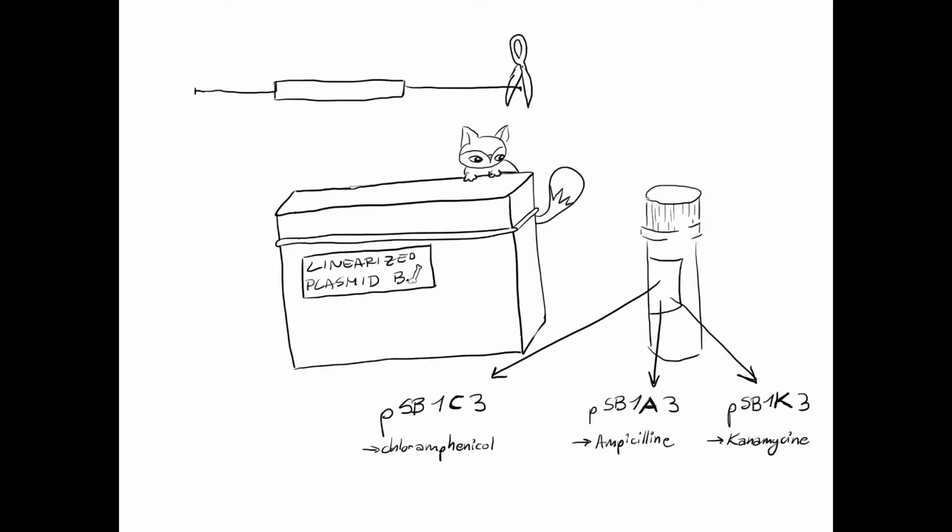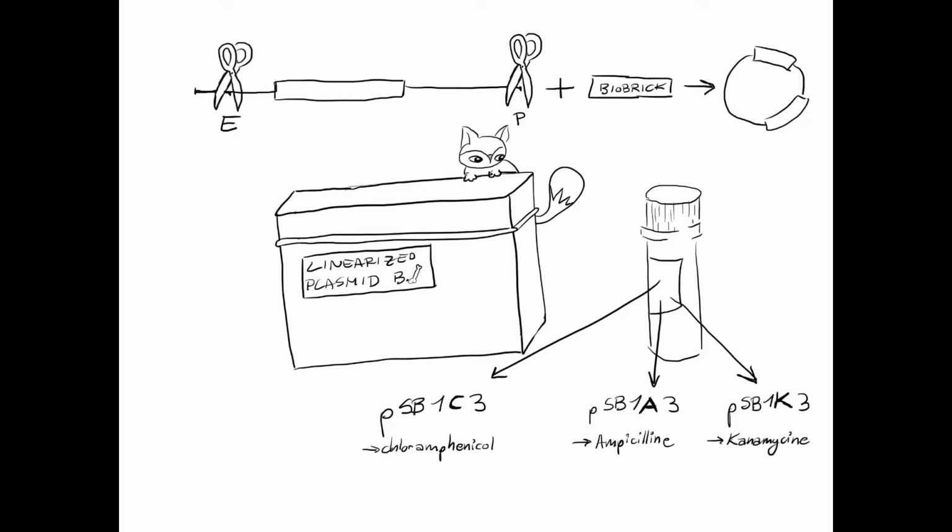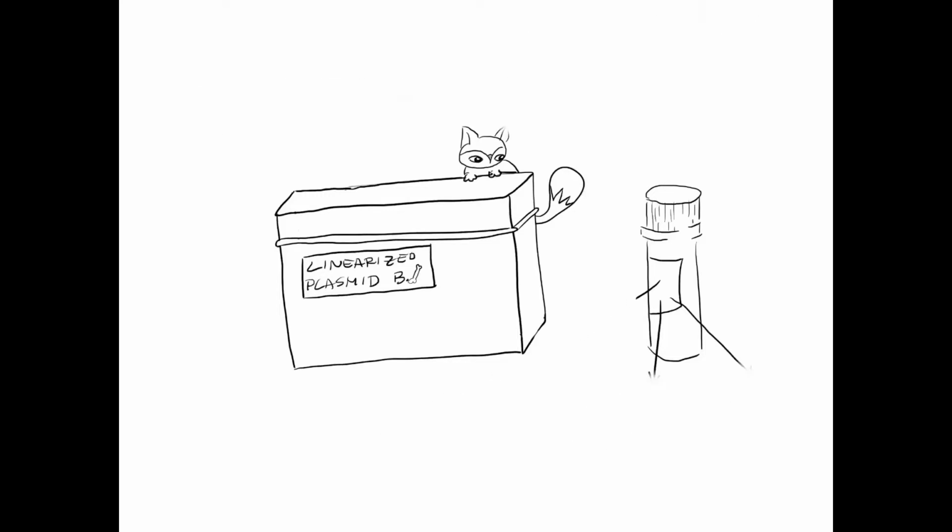It is important to note that the plasmid backbones are PCR products. They must be digested with EcoRI and PstI to combine them with a biobrick of your choice, digested with the same restriction enzymes, in order to transform them into your competent cells.